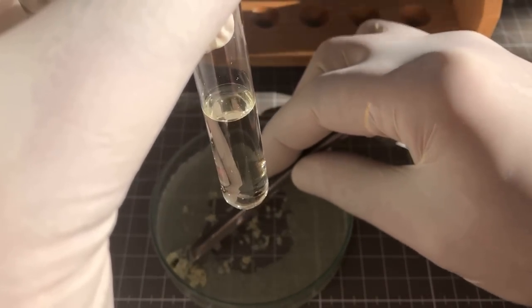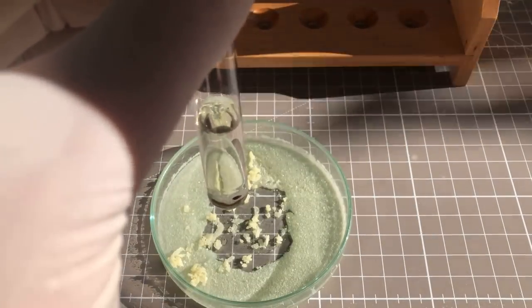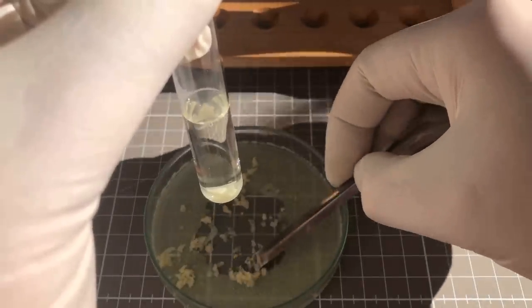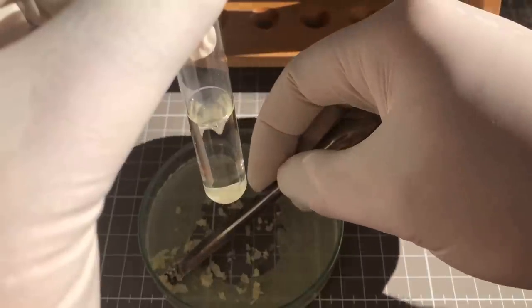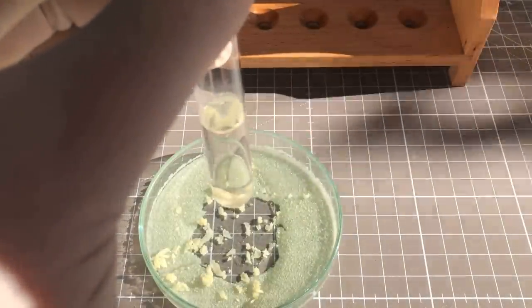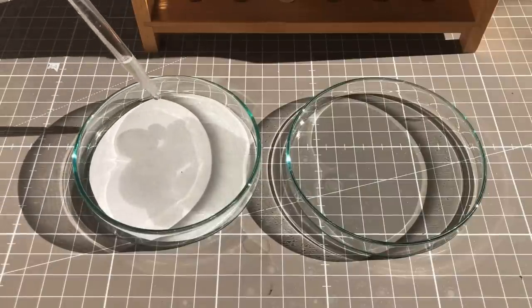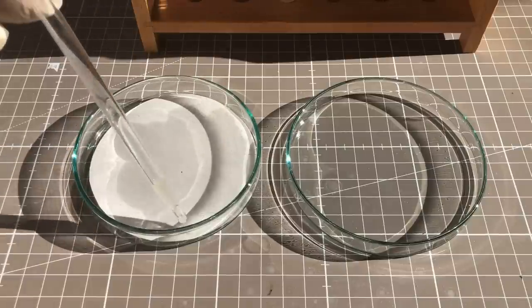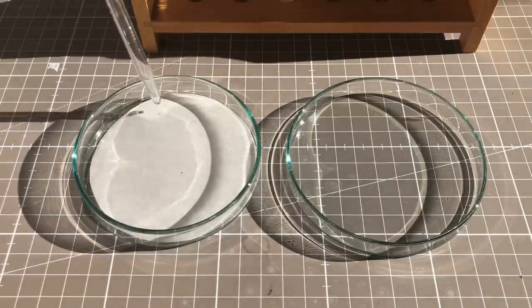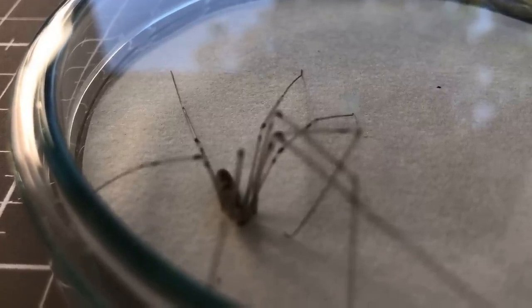To test the toxicity to insects, a few milligrams of the lindane were dissolved in some acetone. Then a filter paper was sprinkled with the solution and the acetone was allowed to evaporate.